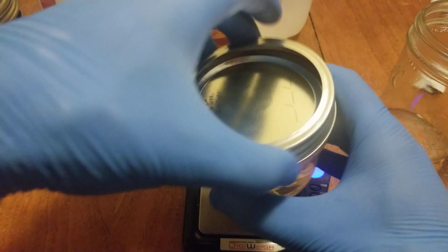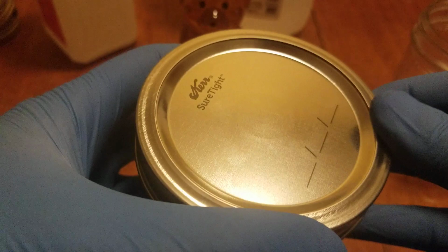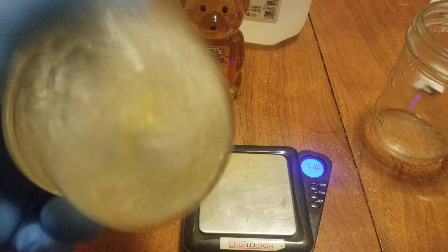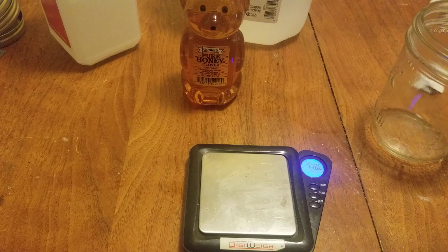Before you get too far into this, if you're using a bigger jar, you're going to want to put your holes in it. I don't like to use big jars. I'm going to give this a little shake, try to get everything moving around in there, get it all mixed up very nicely. That's the thing about real honey, that's how you know it's real. It's pretty sticky stuff.